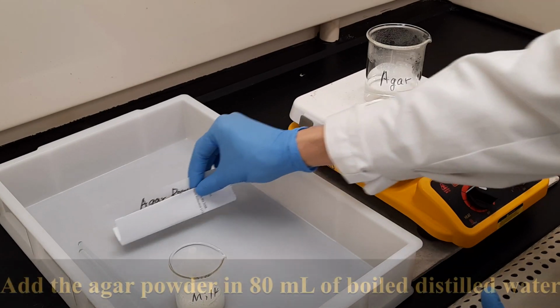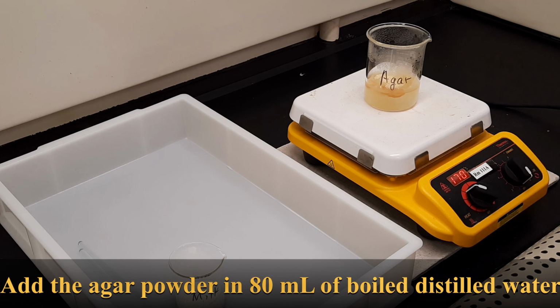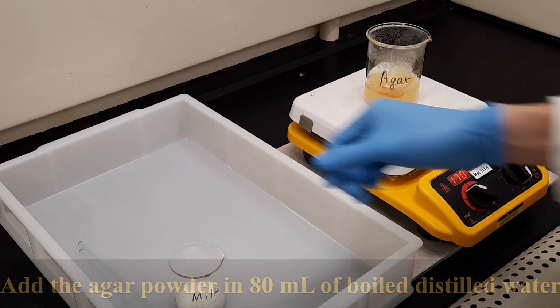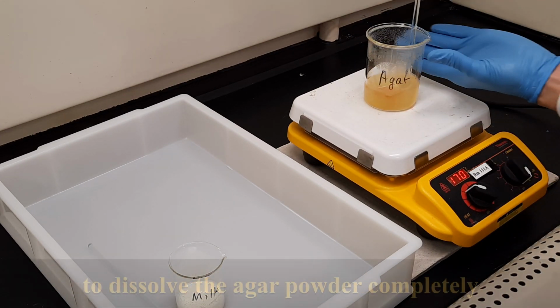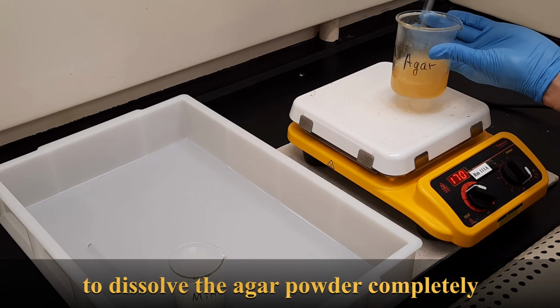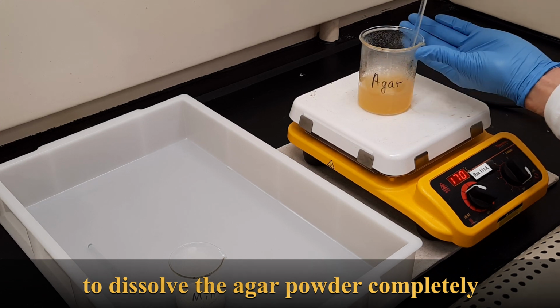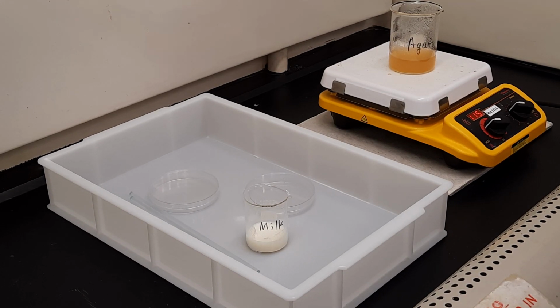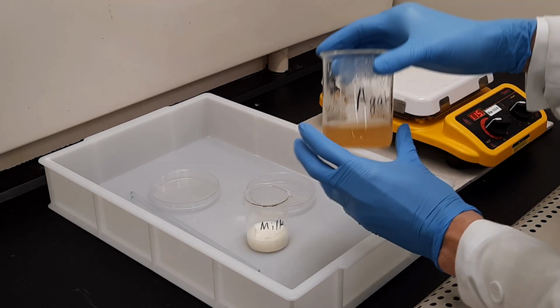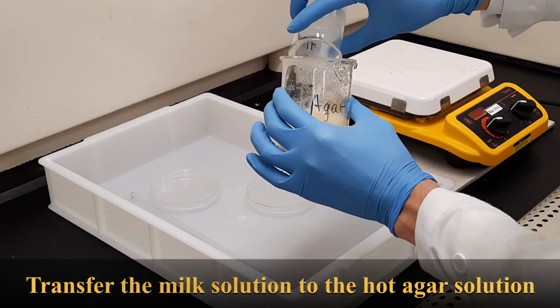Add the agar powder in 80 ml of boiled distilled water. Heat the mixture and stir frequently to dissolve the agar powder completely. Transfer the milk solution to the hot agar solution.